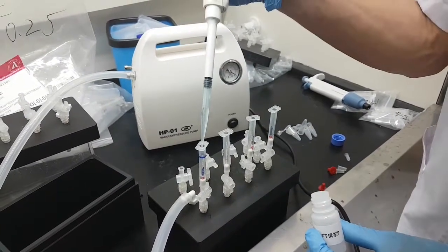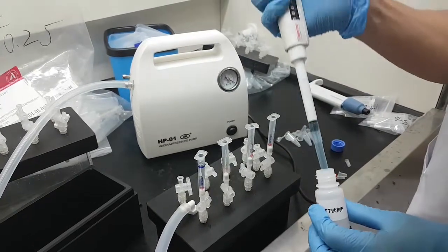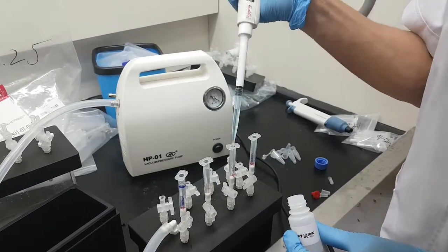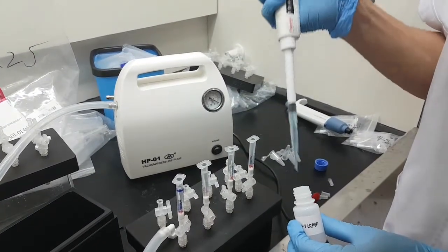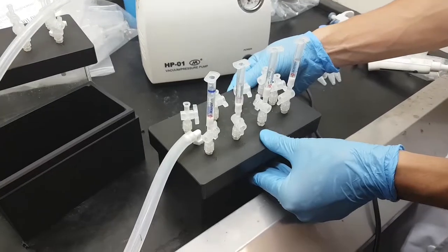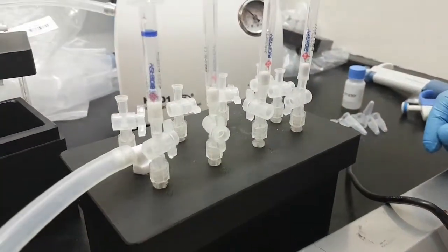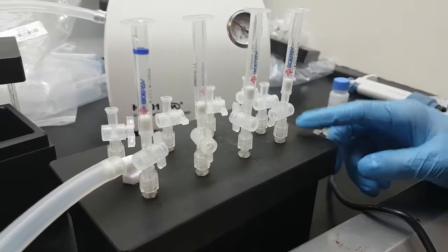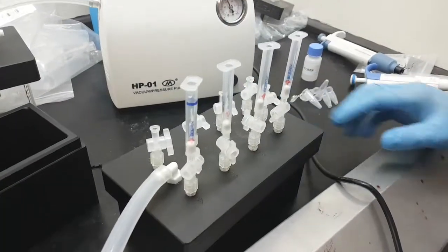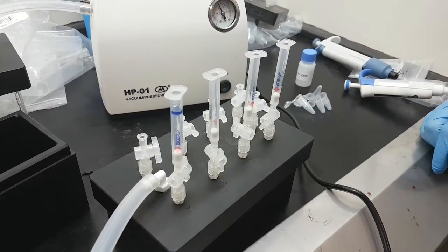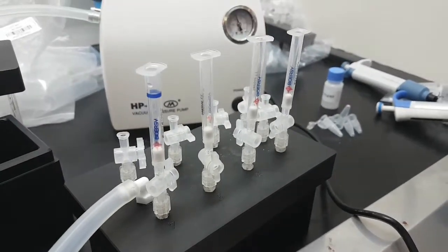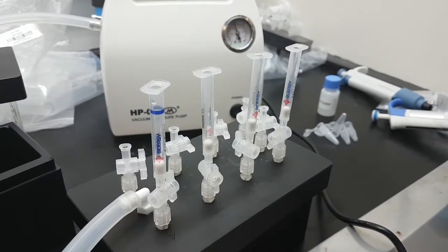Now we will put reagent F to the extraction columns, one milliliter of reagent F. Turn on the vacuum pump and let the liquid flow. Wait for 5 seconds, for extra 5 seconds after the whole liquid was flown through the extraction column.